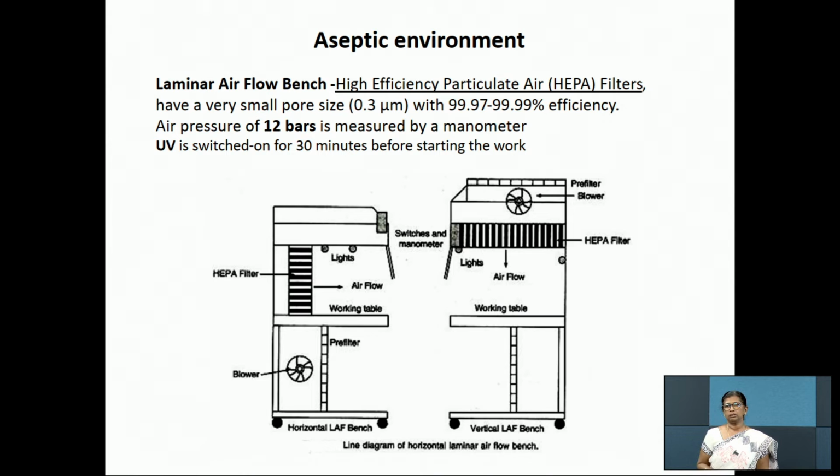So it is also very much helpful, and this is the horizontal airflow chamber, in which the air is flown from backside to the front, whereas in the vertical airflow chamber, from the top the air is flown towards the bottom.